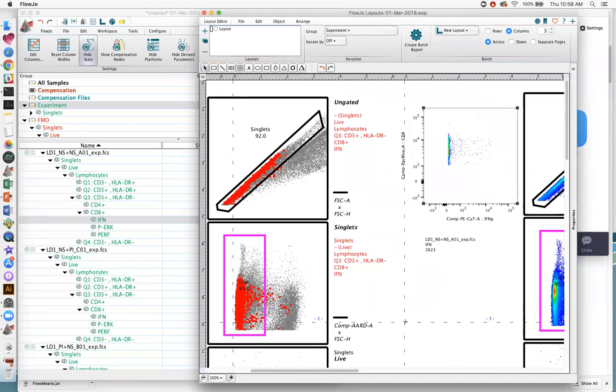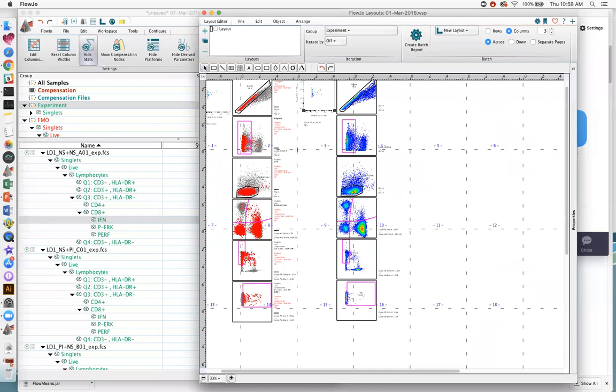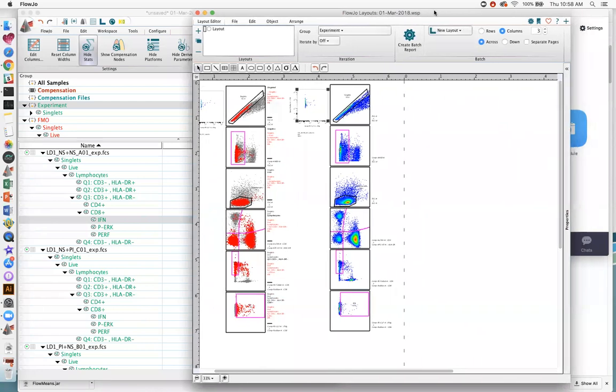All right, so once you have that, we have a basic setup here. You can use the page delineators to put how many plots you want on a given page. You just go to where the two dashed lines intersect one another, and you can see how my mouse changes from an arrow to a plus. And you move it far enough, you get either portrait or landscape, depending on how you want. Okay, and then from here, if this is the setup that you would like, you can go ahead and choose the type of export that you want.